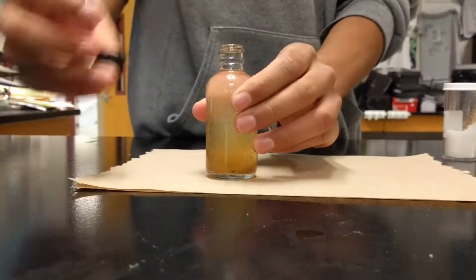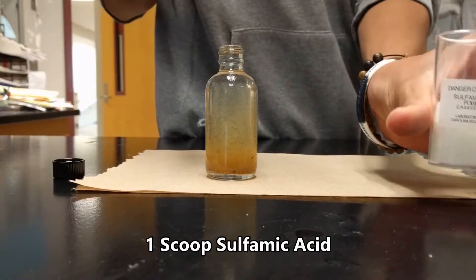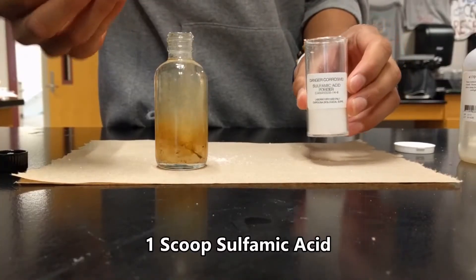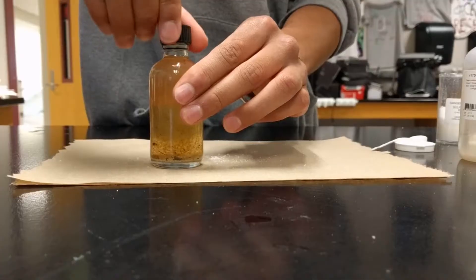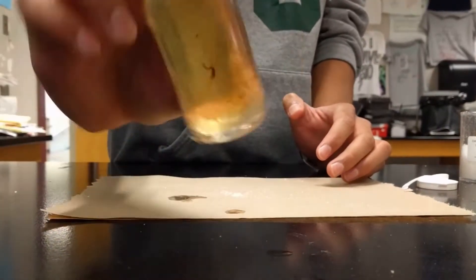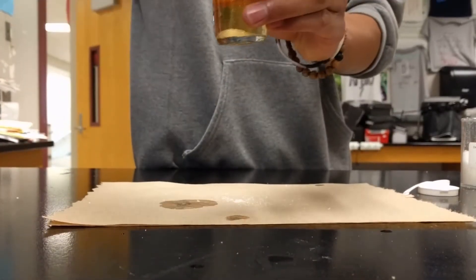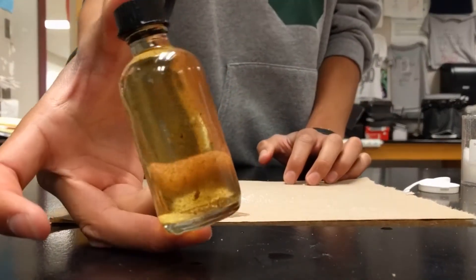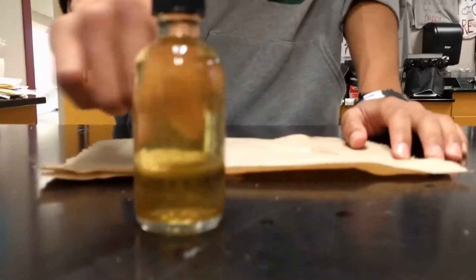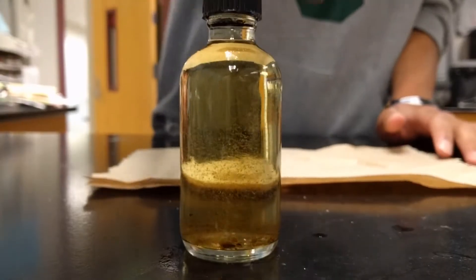So we are going to continue measuring the dissolved oxygen of our sample. Now we are going to add 1 scoop of sulfamic acid. We will cap it and mix it to make sure all the solid precipitate and sulfamic acid are dissolved. There should no longer be any solid besides the pond filtrate — it is a clear yellow besides the dirt and pond residue.